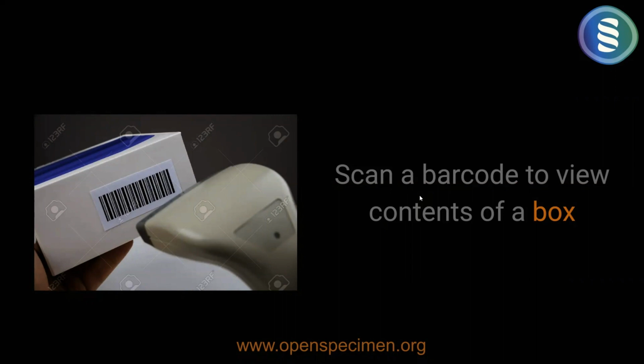That is, when you scan a box, you should be able to see the whole layout of the box, what the details of the box are, as well as what specimens are stored in the box, and then click on the specimen to see an overview of the specimen. So things like that you will be able to do when you have each of your boxes barcoded, and the barcode of the box is available in OpenSpecimen.